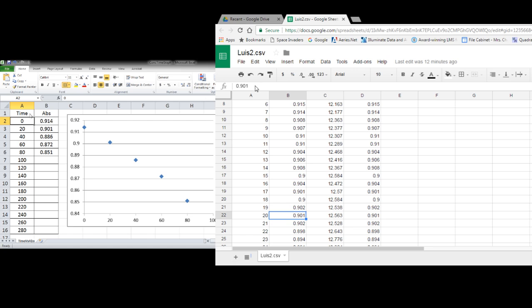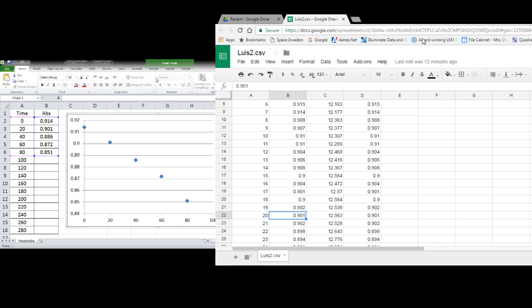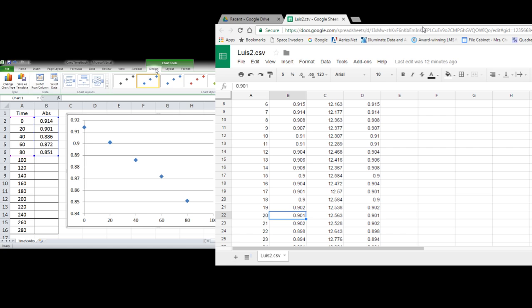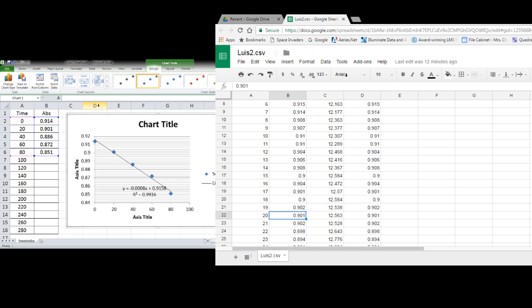And you'll get this look here. So the border tab is very important. If you go to the design tab up here on chart tools, you can change this graph so that you can actually get a straight line on there and get some data about the graph.